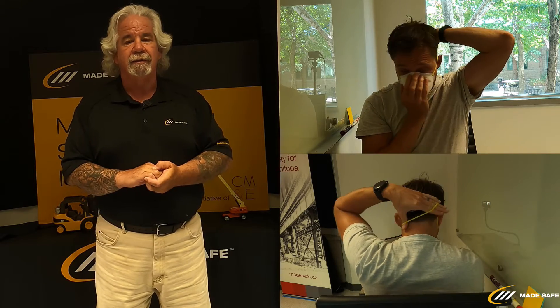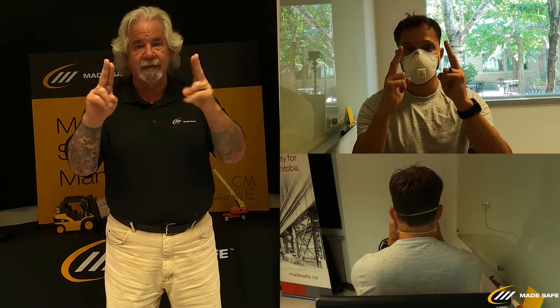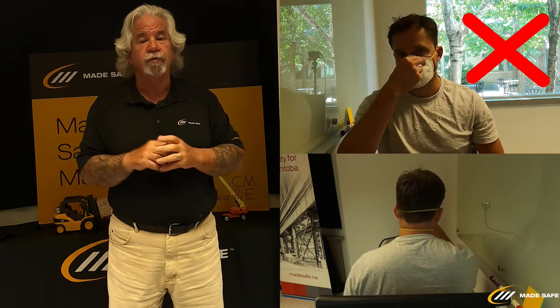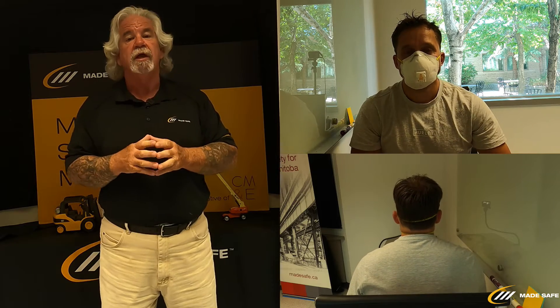Then bring the next strap over the back of his neck. At this point the mask is on, but if you have long hair, this is where you would pull all your hair out so the strap sits right against the back. Now that the mask is on, we're going to do the negative and positive checks. Reg will take two fingers on both hands and form the nosepiece around his nose. We do not pinch it with one hand — we use two fingers and two hands to form the metal piece around the nose to get a solid seal.